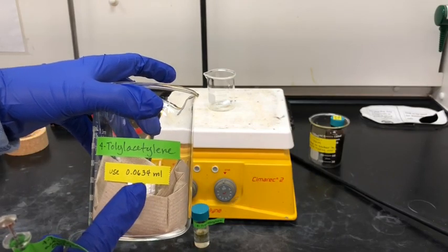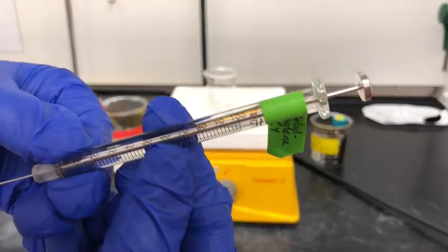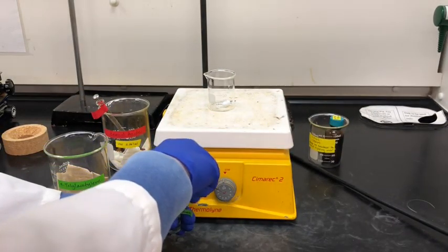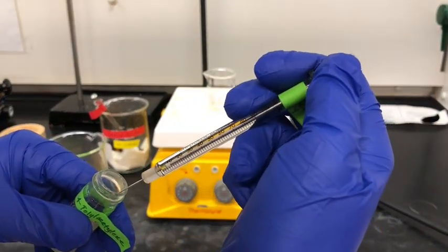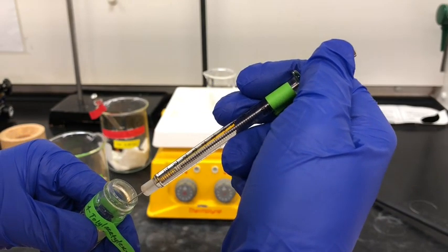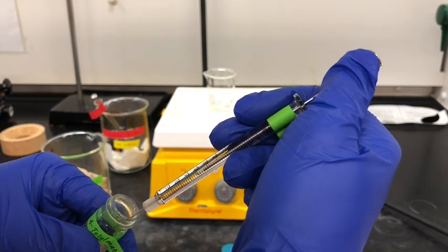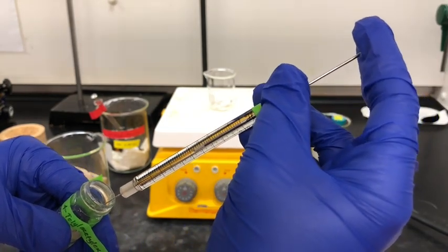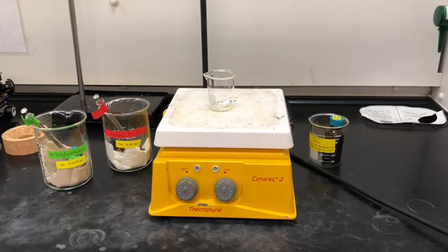Now we're going to do the same thing with 4-tolylacetylene and we're going to need 63.4 microliters, which might be a little difficult to measure out but I'll try my best. You'll notice I'm using the same type of syringe but it's a new clean syringe, so we want to make sure we're not cross contaminating. Again I'm going to draw the solution up as slowly and carefully as possible, and then once I'm happy with the measurement I'll add it to the same beaker.